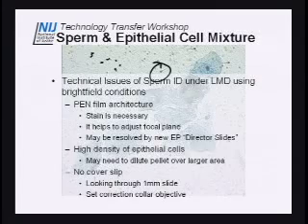She just says the technical issues, and really it takes more practice, just looking at lots of slides, and after a while you get used to these little idiosyncrasies of the specimens. I just put this set correction collar objective, since you're looking through the slide. It'll be adjusted for you in the class, but if your correction collar isn't adjusted for the 1 millimeter, that can really mess up your image. So if you don't get a clear image, you might need to set your correction collar on your objective to 1 millimeter.